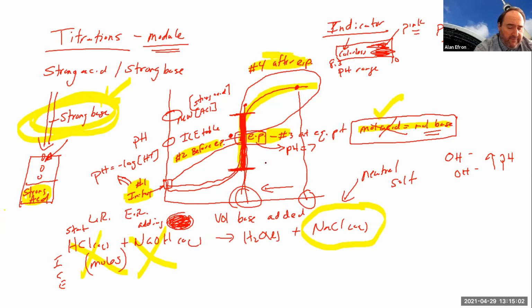So that's why, for example, most people have experience using phenolphthalein as the indicator. And that's why in most cases they tell you to make sure you get that lightest color of pink, because that should keep you within this equivalence point range. Even if you technically go past the equivalence point, you'll still be able to figure that out. Any questions on that?